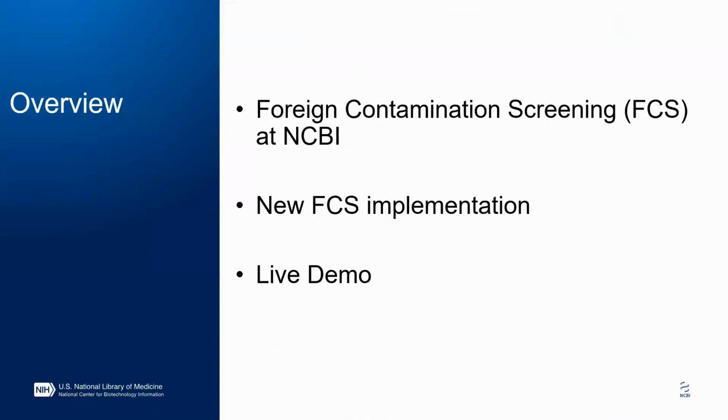So an overview for the webinar content today. First, I will go over a brief background on genome assembly contamination and the current pipelines in use at NCBI to detect contamination. Next, I will provide details on the new NCBI FCS implementation that includes publicly available screening tools. And finally, I will run through a live demo to show how a typical user could run FCS tools in the cloud.